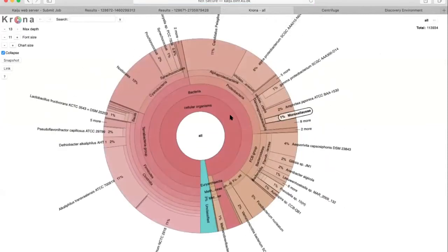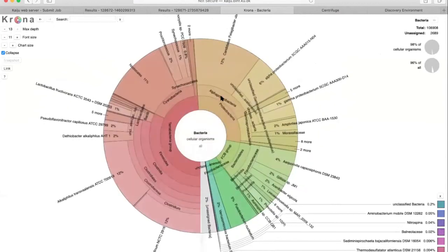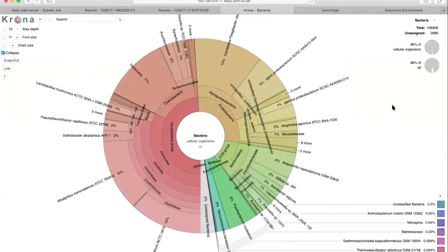And it looks pretty similar. Let's click on bacteria. And it looks like we haven't gained a ton of knowledge here, except there are a lot more firmicutes than there were in the forward-only reads. And I would say less flavobacteria, probably. So, these are nice results, definitely something that you can start with, and mainly very easy to run if you're willing to go sample by sample.